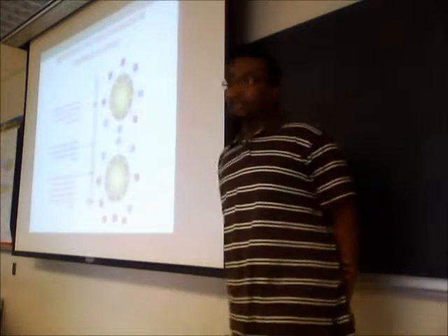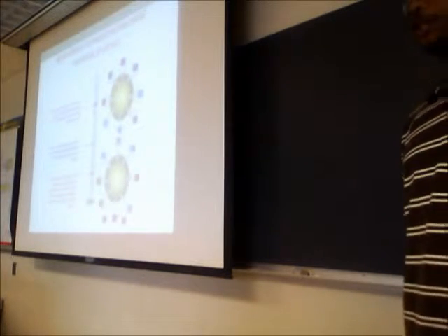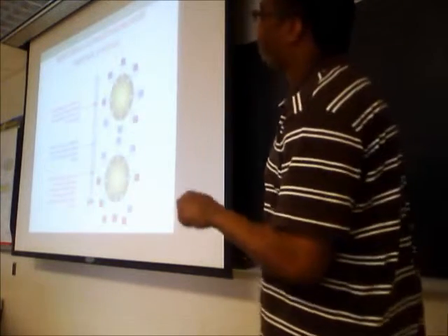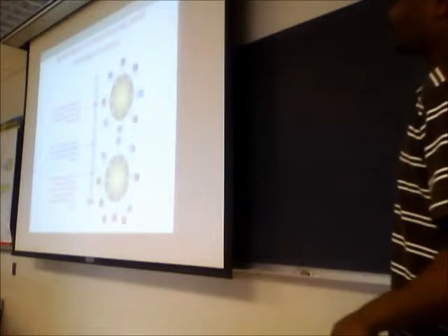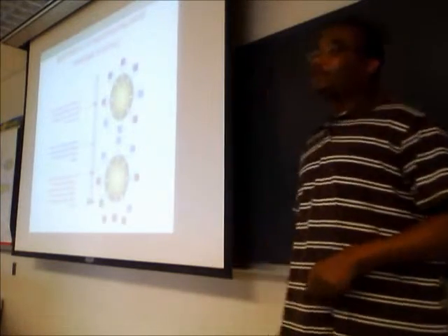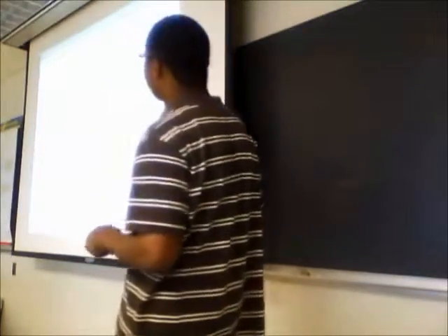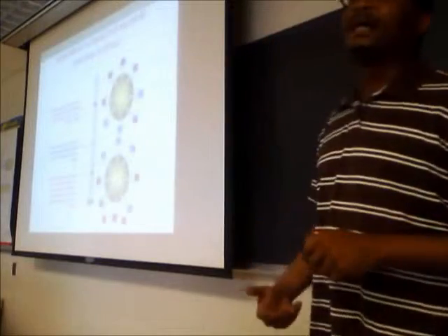So these molecules are going to be eluted based off of their overall charge. You see here a depiction of a typical ion exchange column and the proteins which are bound in the column. At the top, you see the proteins of more highly charged molecules are more tightly bound.